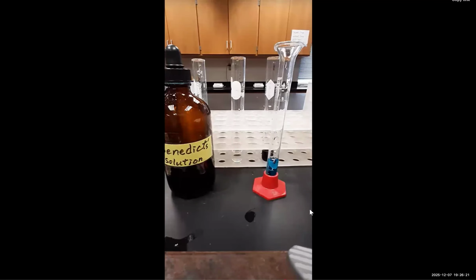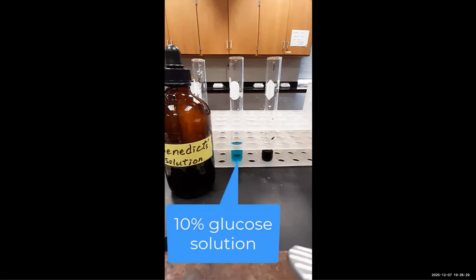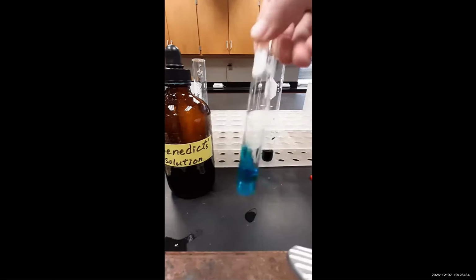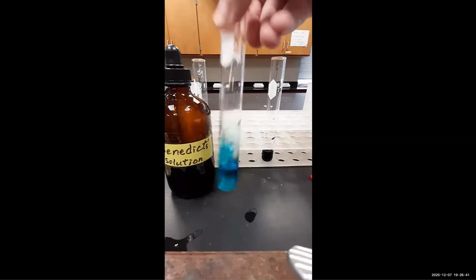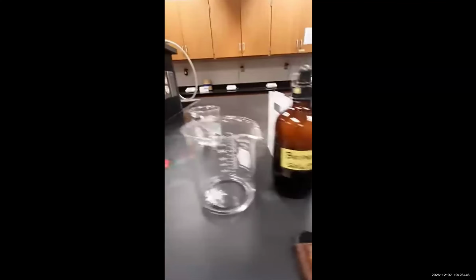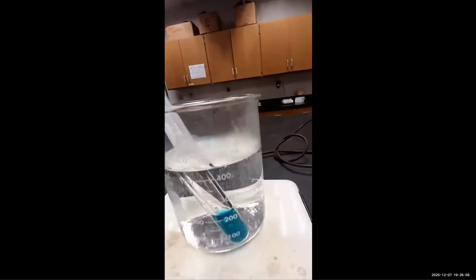Finally, we have a 10% glucose solution and we're treating it with Benedict's solution. That's that blue solution that we're adding. So we're treating the glucose solution with Benedict's reagent. Now this reaction requires you to heat it in order to see what the positive test result looks like. So we're going to mix these solutions together and then heat it in a boiling water bath. So here's a boiling water bath. We're going to let this sit in the boiling water bath and then we're going to observe the final results.